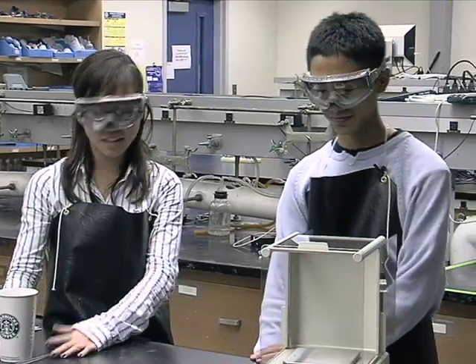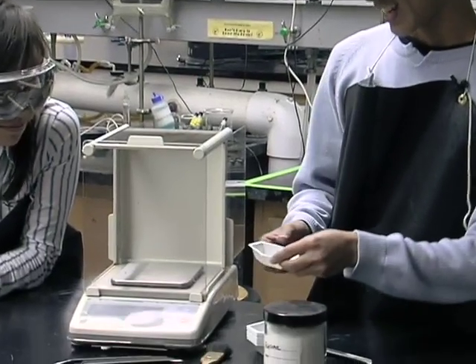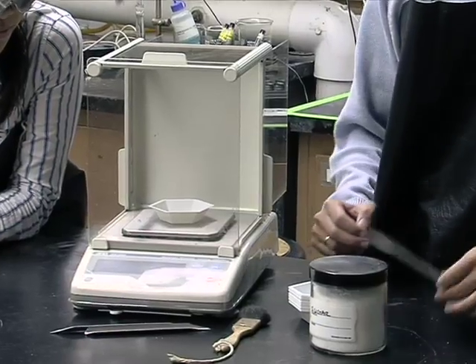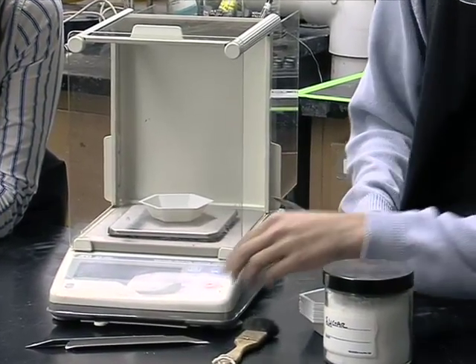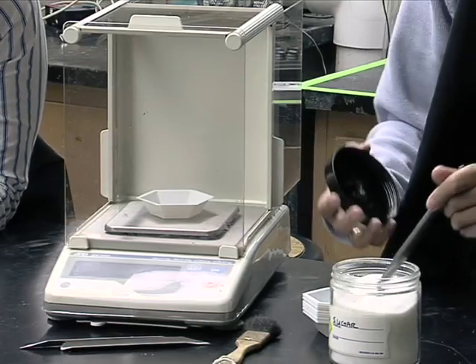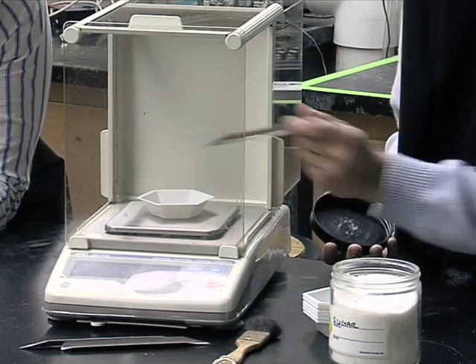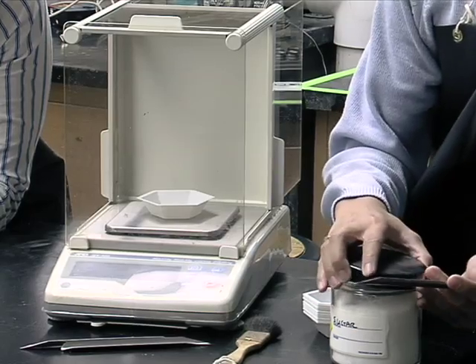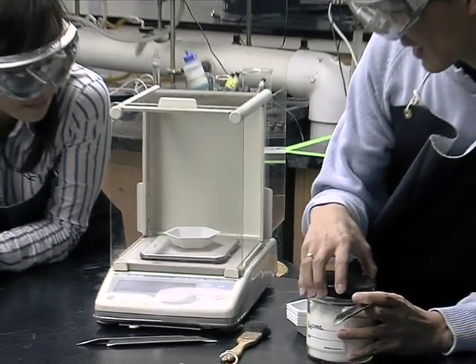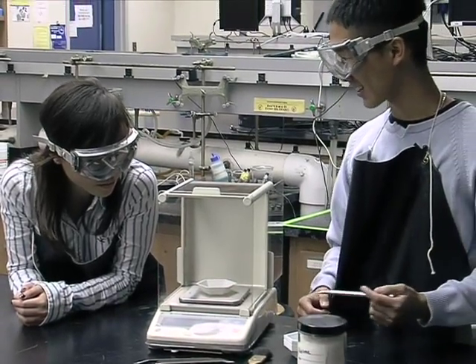I'll go do it again. Okay, I'll watch you this time. I'll put a boat on the scale and then I'm gonna tare it. Then I'm gonna get some sugar. It reads .595 grams. Is that okay?